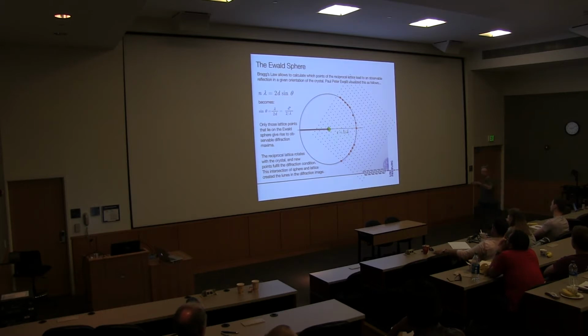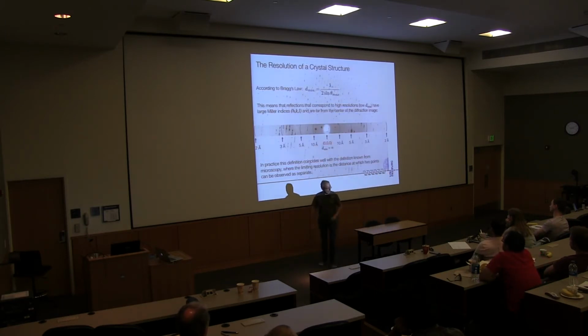So you probe the entire reciprocal lattice with your detector. And what's also in the concept of Bragg's law is this: this is actually how we define resolution in crystallography. We don't say a resolution of 2.0 angstroms means that if you have two atoms at 2 angstrom difference, you still get separate maxima. That's actually pretty much what comes out, but the definition of it is this.